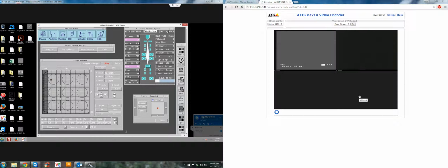Now it's time to find your sample. Okay, everything's initially set up. The beam is saturated but not properly heated up. Maybe it hasn't been an hour yet, but you can still find your sample. That's a big step there.